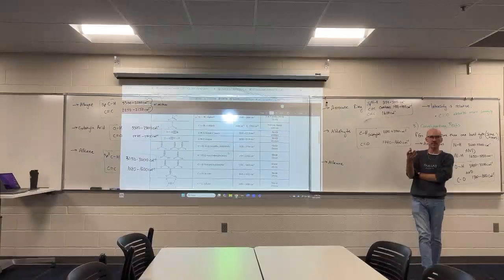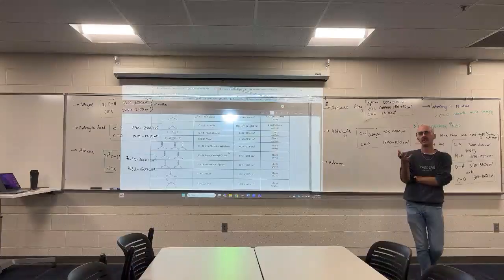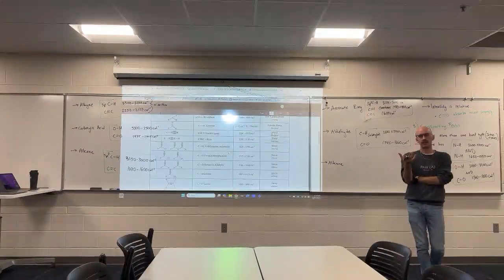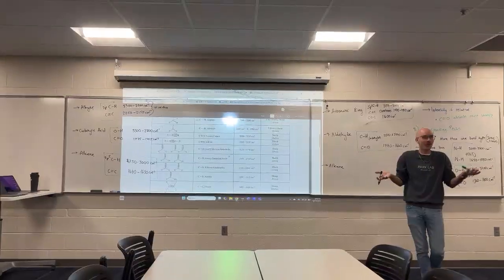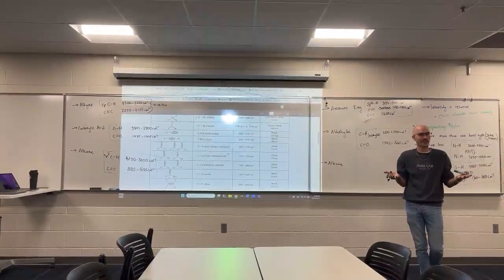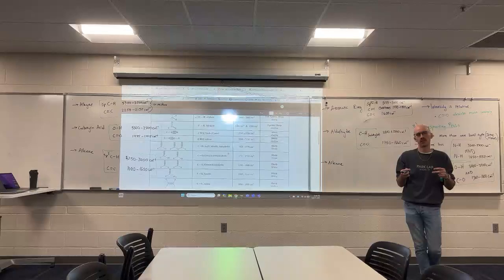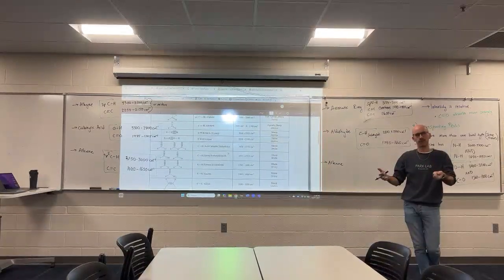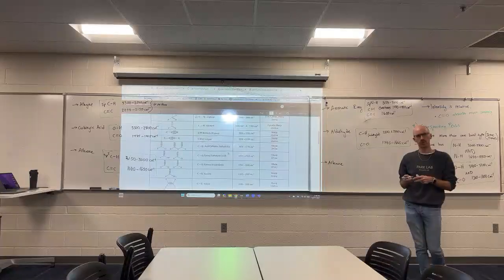Anytime somebody says sp2CH, they're referring to a hydrocarbon functional group, alkene or aromatic ring. And to describe the CH of the aldehyde, despite also being an sp2 hybridized carbon, they normally don't refer to it as its hybridization, but more to the fact that it's part of a non-hydrocarbon-based group. It's part of the carbonyl group.